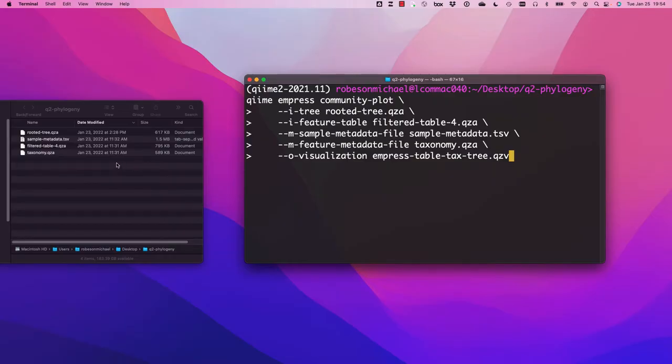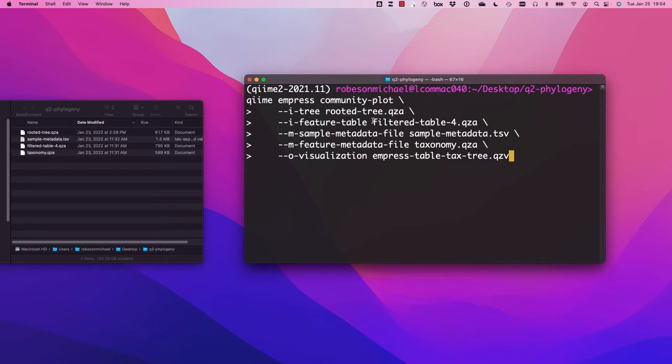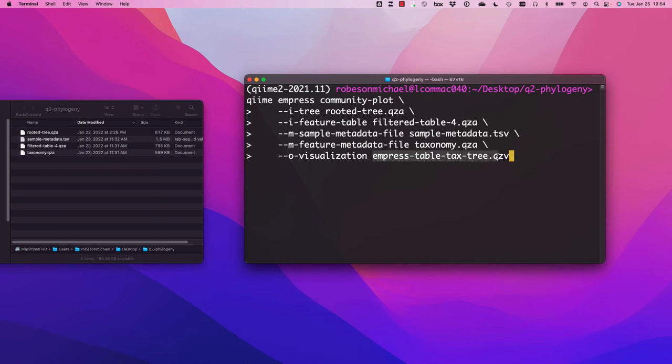As you can see, I've already downloaded all of the files we require to run Empress. I've pasted the command here in my terminal. You can see we have our rooted tree, our feature table, our metadata, our taxonomy file. And we're going to write this out as the Empress table taxonomy tree visualization.